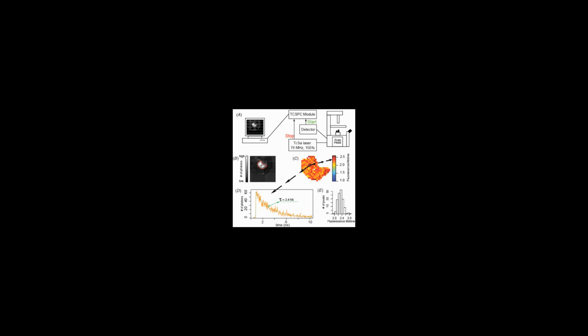One of the interesting features of the convolution theorem is that the integral of the convolution is the product of the factors that make up the integral. There are a few techniques which work in transformed space that exploit this property to recover the pure decay curve from the measured curve.